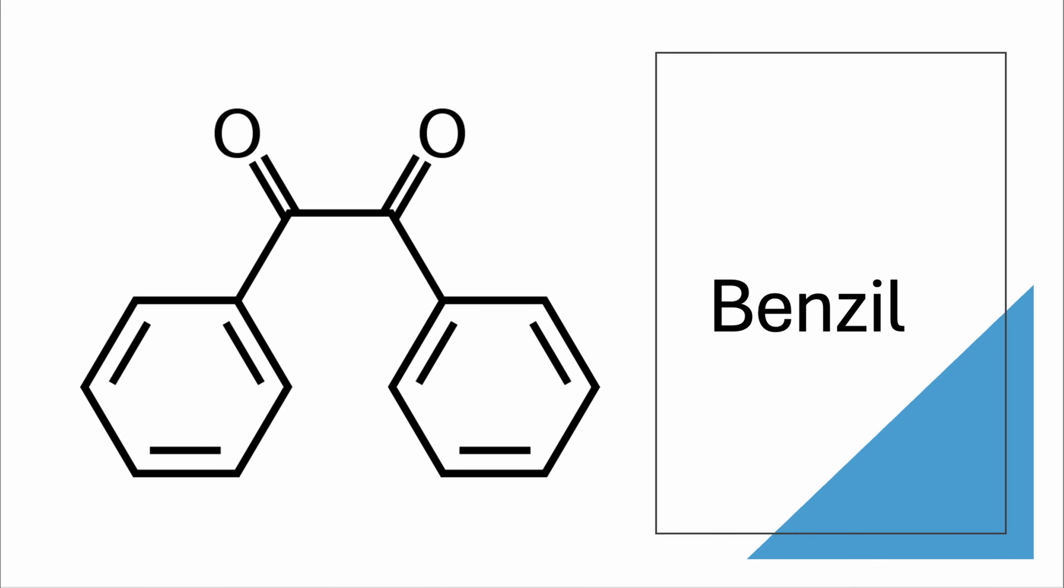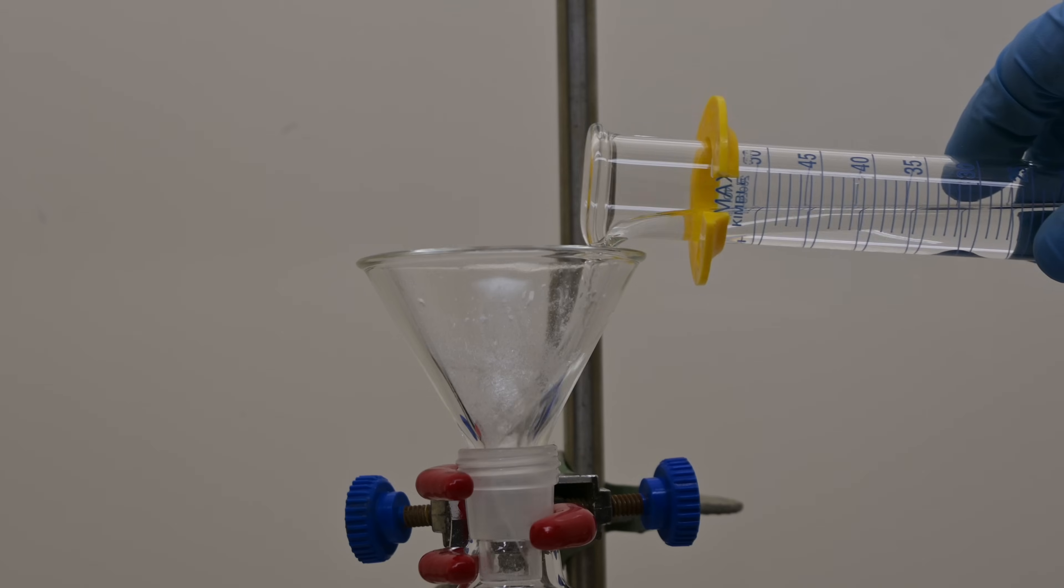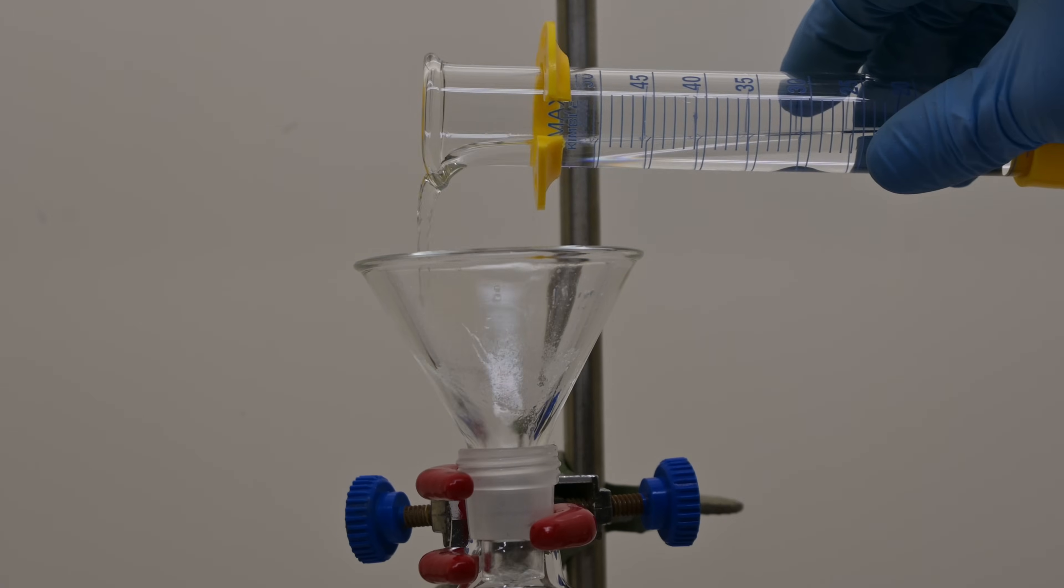Now we're ready to move on to the next step, converting benzoin to benzil. First, let's carefully weigh out 4 grams of finely pulverized ammonium nitrate and place it into a clean dry 100 milliliter round bottom flask equipped with a magnetic stir bar. Next, we add 8.5 grams of benzoin into the flask. Then we transfer 25 grams of glacial acetic acid into the flask.